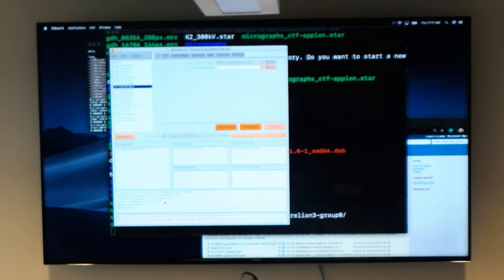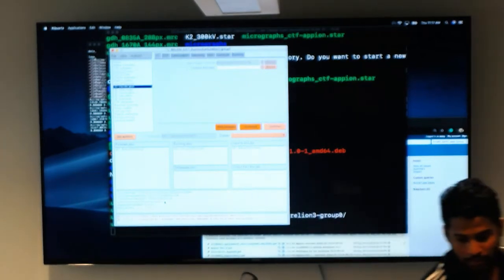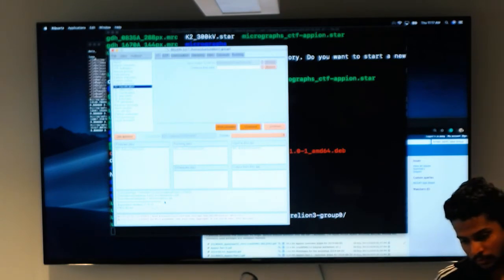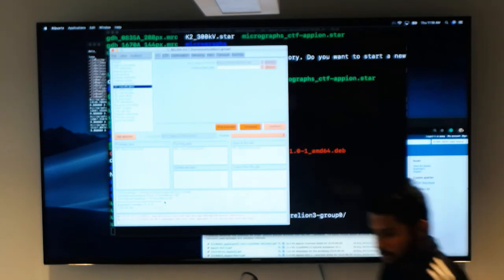Let's see what new error. It could also be the instance. Ah, okay, let's see. Abort MPI processes. This particular instance doesn't like it. It's getting an error, Relion error. Yeah, we have to check the IP and see if everything's linked appropriately.